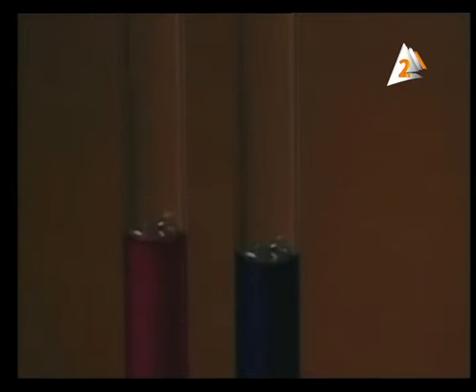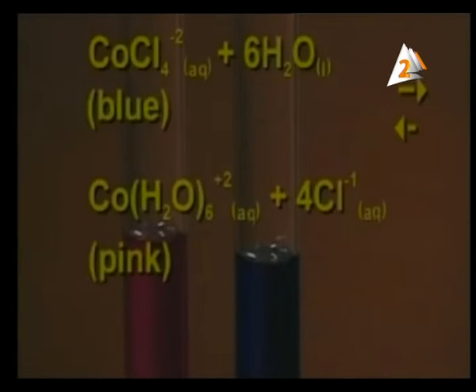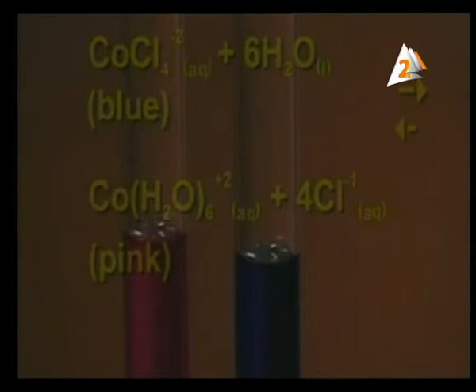Here we have 2 test tubes. One of them contains a solution of cobalt chloride, blue in color. And we have cobalt dissolved in water, pink in color. Plus water.